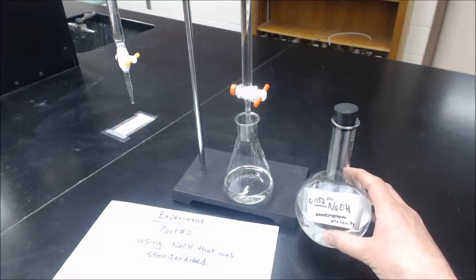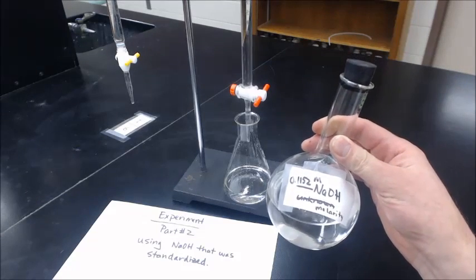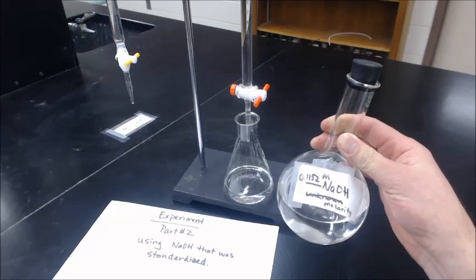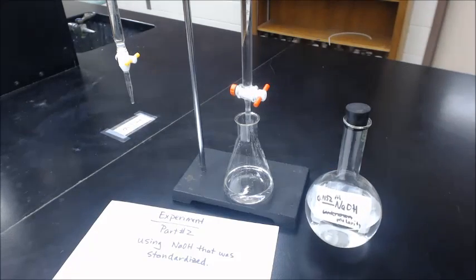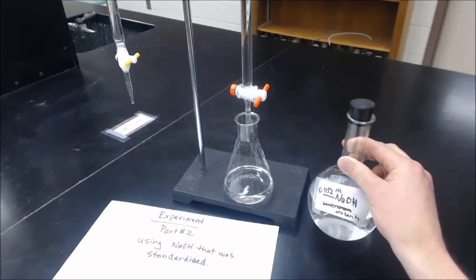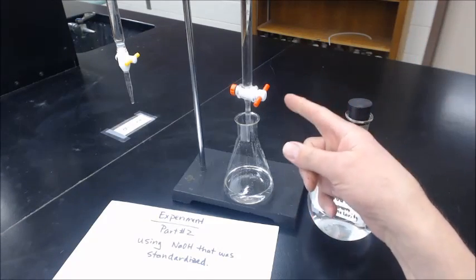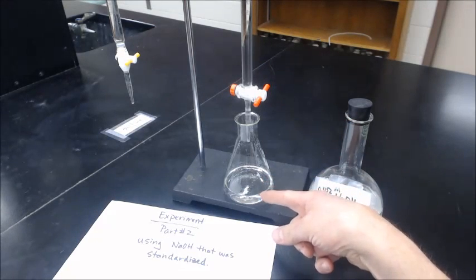In part two of the experiment for Monday, you're going to use your new standardized sodium hydroxide solution. You're just going to maintain it in this burette. We know the molarity. Don't throw this out. Since we know the molarity, we can now use it in a titration on an unknown acid.